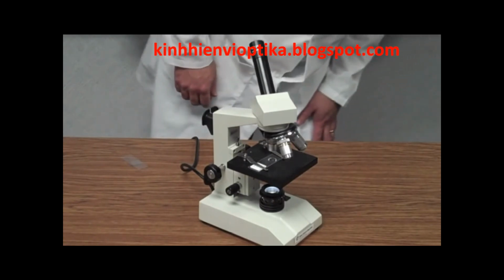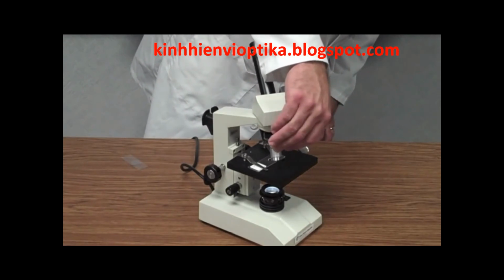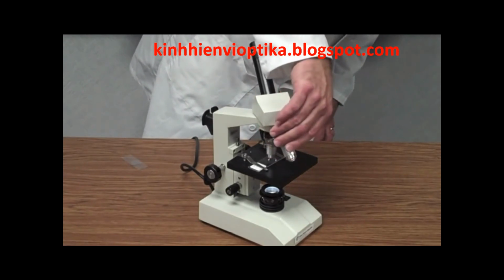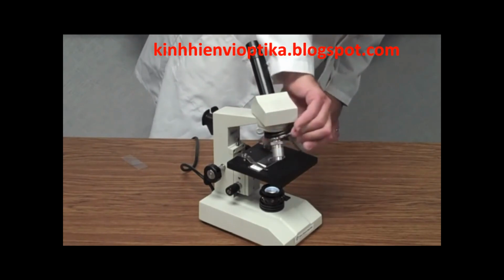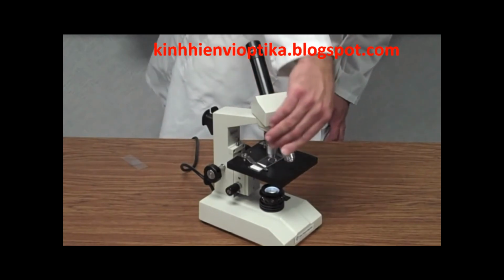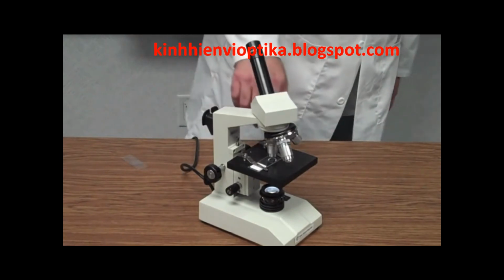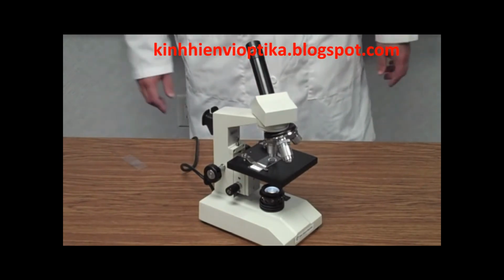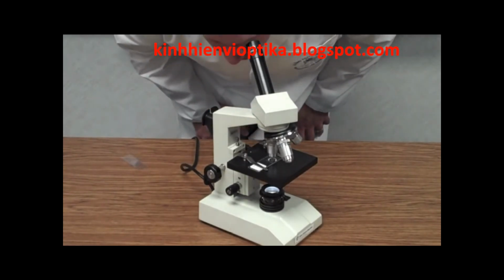So I look from the side and I simply take the medium objective and lock it into place. The reason I'm looking from the side is I don't want to ram that objective into the stage, which could possibly cause damage to the objective. Here I've got plenty of room, so I'm going to lock that medium power objective, the one with the yellow band, in place. And then I'm going to look through the eyepiece.